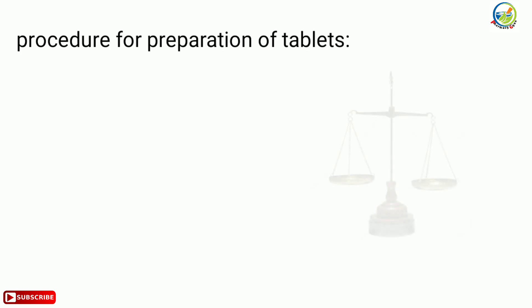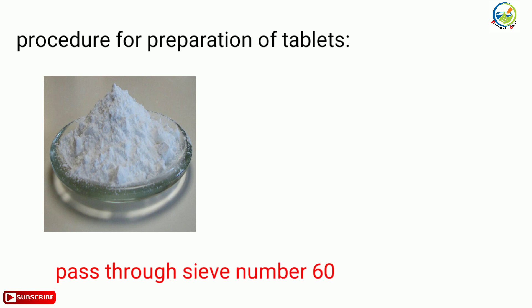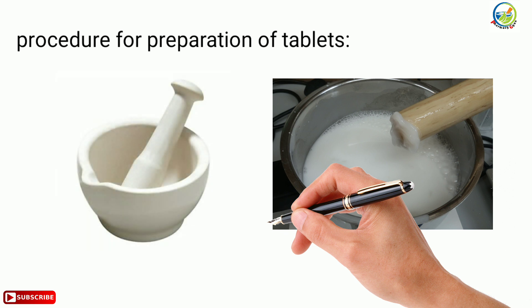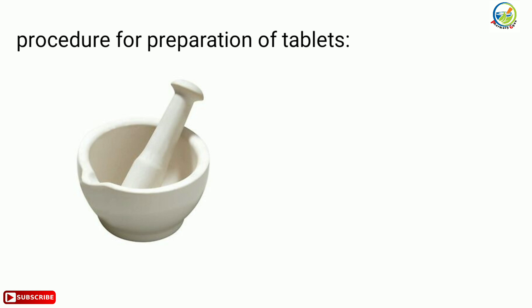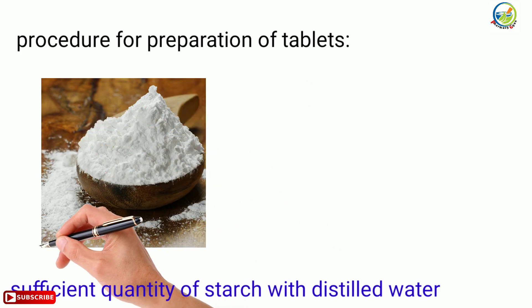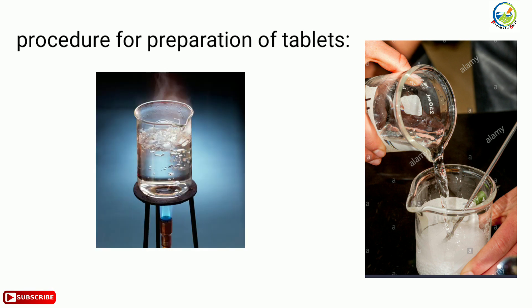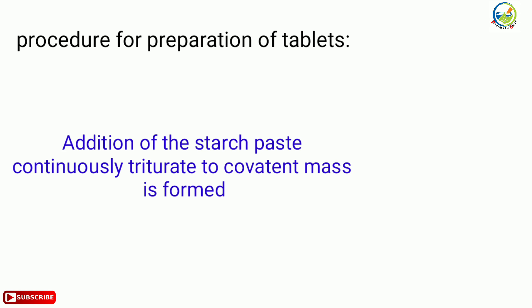The procedure: weigh the required quantity of paracetamol, lactose, and pass through sieve number 60. Add starch paste slowly to the powder mixture and mix thoroughly for uniform distribution of the binding agent. Starch paste should be prepared by mixing sufficient starch with distilled water and warming to a sufficient temperature to make a thick paste. Continue addition of the starch paste until a wet cohesive mass is formed.